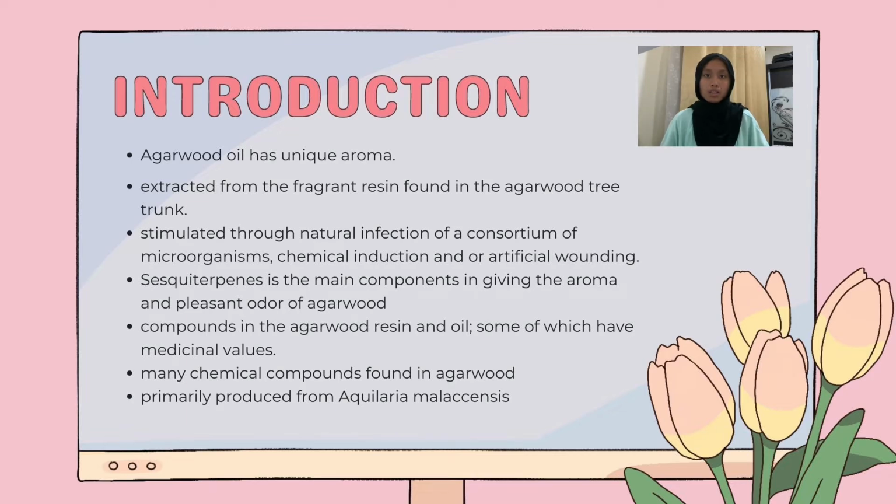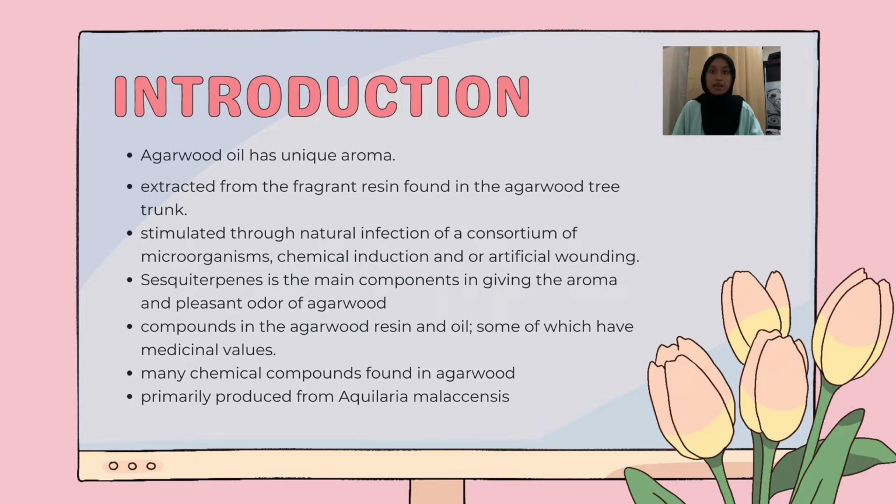The unique aroma and the quality of the agarwood resin and oil are contributed by the presence of certain chemical compounds. Sesquiterpenes have been reported to be the main active components that play important roles in giving the aroma and pleasant odor of the agarwood. However, there are many other chemical compounds in the agarwood resin and oil.